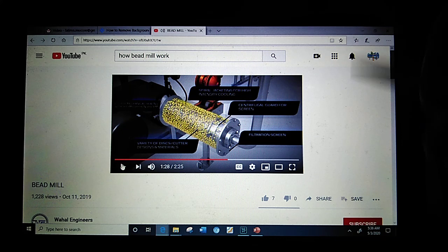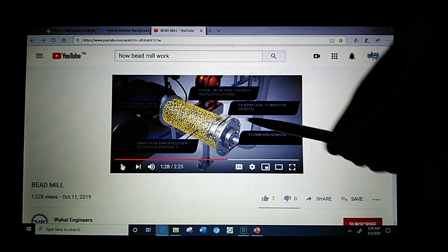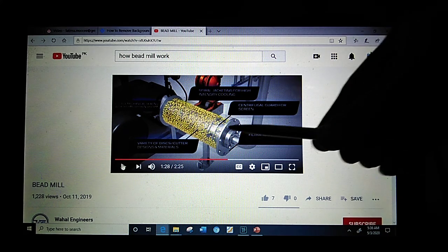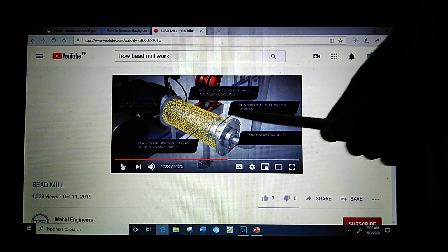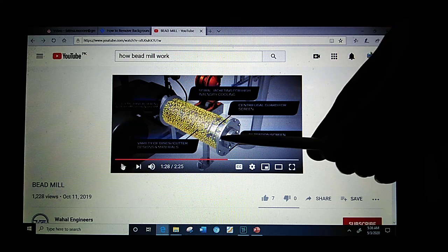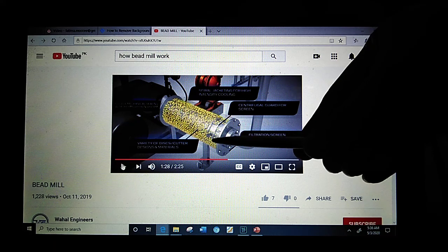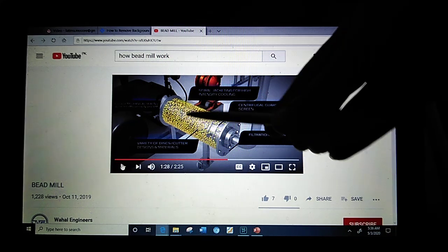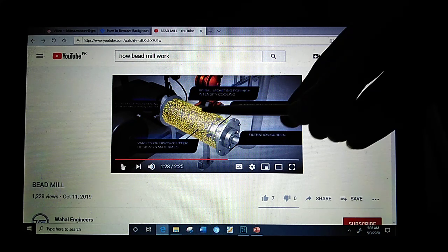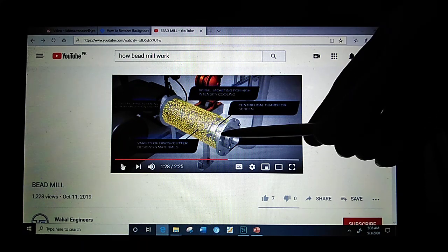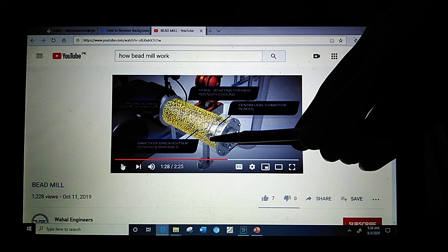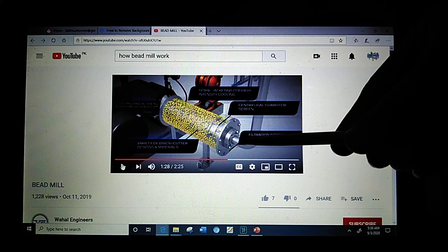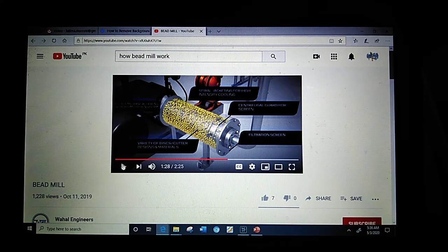Here you can see the agitator which is agitating, as a result of which these yellow beads are moving. In this part, the cell suspension is exposed to these moving beads which cause the lysis.